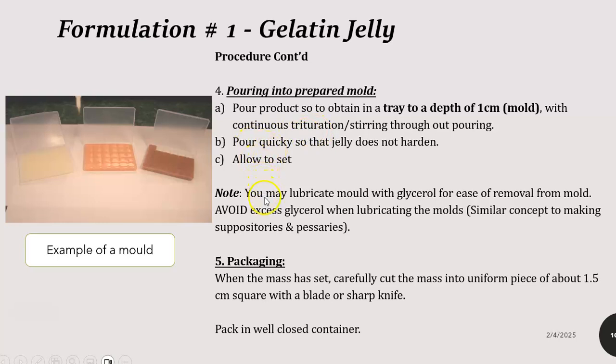And then now you just sanitize a scissors, or you can use your stainless steel spatula. And for us, we're going to cut the zinc jelly into strips, and wrap them in grease paper and package them as is in a well-closed container, because again, gelatin will lose moisture and become very dry or tough to manipulate.